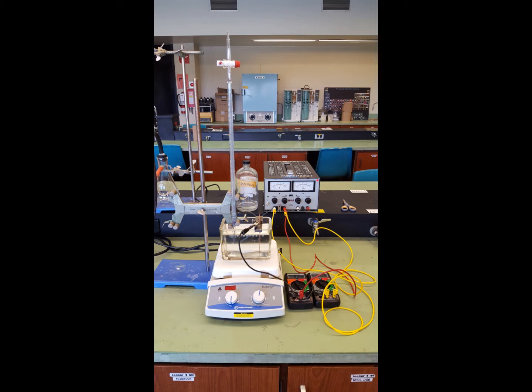And you'll see we have a hot stir plate. Now the heat's turned off and we're stirring at about 500 RPM. On the plate we have a glass electrolysis tank and a fairly large stir bar, about 2 inches. The tank is filled about 3/4 to 4/5 full with 0.25 molar sulfuric acid. That's 0.5 normal H+ ion.